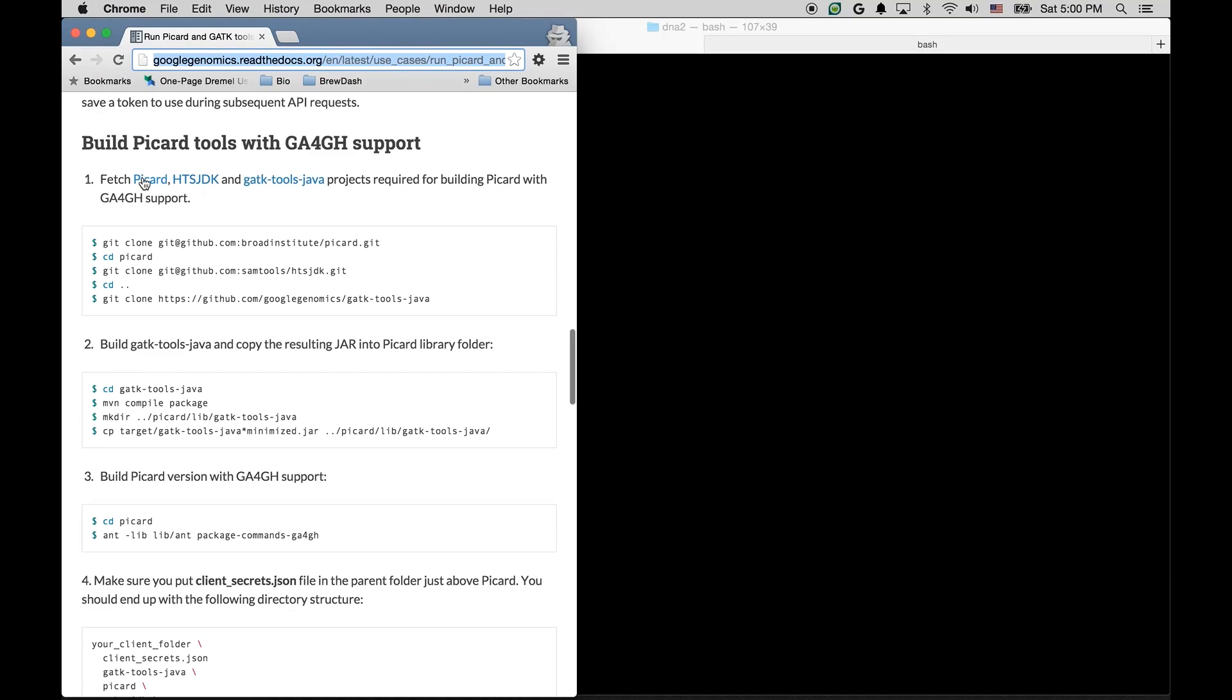The next step is downloading and building three packages we need to make Picard work with GA4GH APIs. First of all, Picard tools themselves. Secondly, HTSJDK Genomics File Access Library, where we implemented support for plugging GA4GH readers.